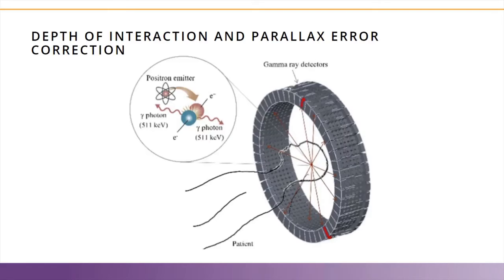Remember from the start of the presentation that as a radioisotope which has been injected into the animal begins to decay, there is a release of a positron which encounters an electron in the nearby tissue. This causes an annihilation event, releasing 2 gamma photons, which travel in nearly opposite directions until they encounter a detector. Once the gamma rays encounter the detector, a signal is generated within the system and is recorded as a coincidence. The system then presumes a line of response between the detectors where the gamma rays were detected. This is where we need to look a little bit deeper to understand the parallax error.